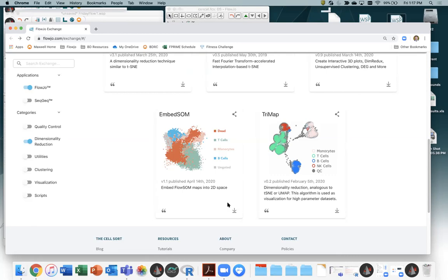You can then use that grid for clustering, but you can also use that grid to preserve the shape of the data and then use it for dimensionality reduction and apply it moving forward. So you would use EmbedSOM if you wanted to make sure that you could take some dimensionality reduced space and use it in this experiment and a future experiment to be done later and another future experiment to be done after that, because you can forward propagate, if you keep the model, how it represents the data, it'll just fit it into that model.